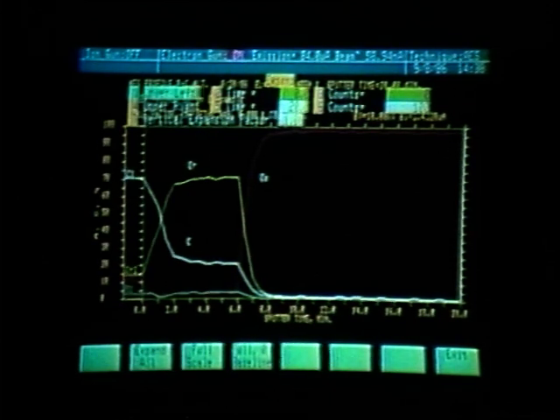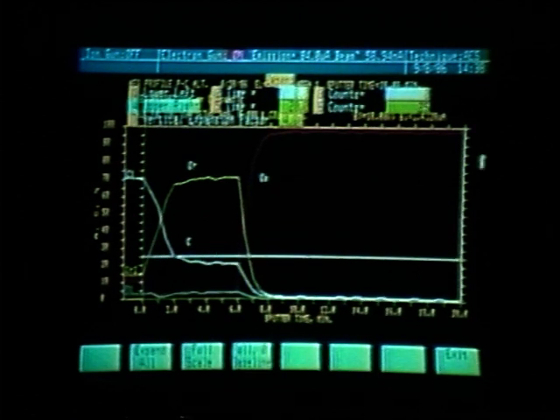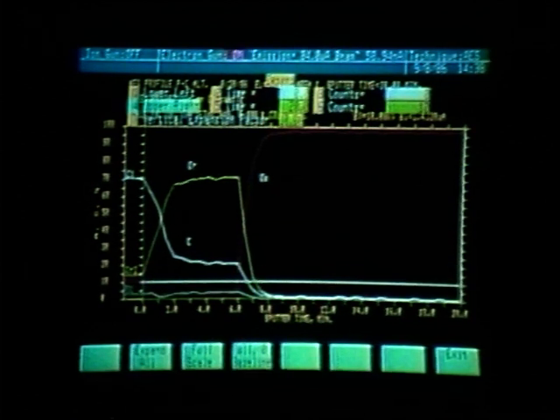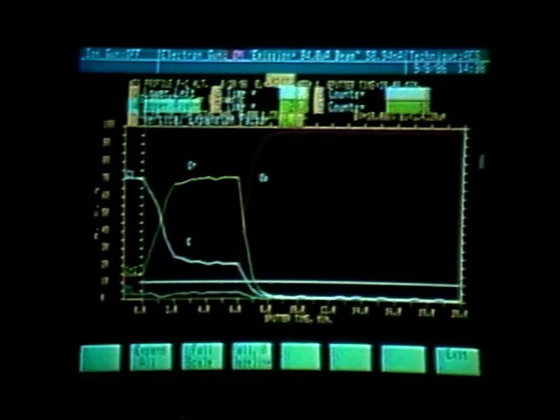To do that, I press function key number 4, which will allow me to move the upper and the right bar, and I can then slew the upper bar using the down arrow to the 10% line. And I now want to expand all, pressing soft key number 2.